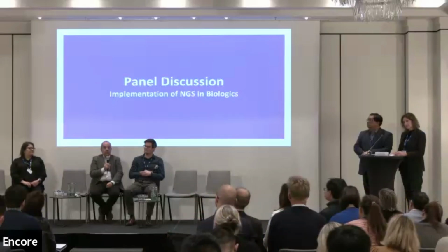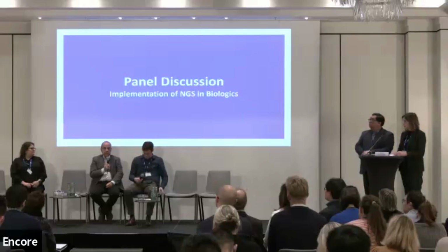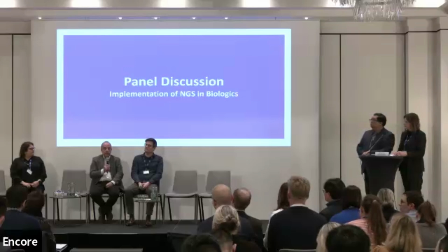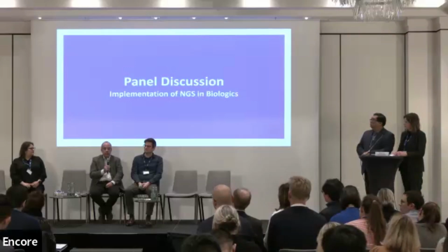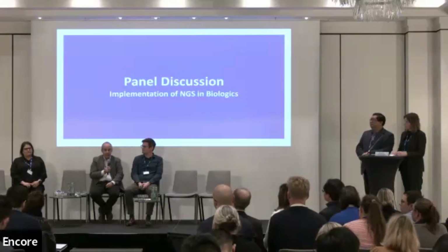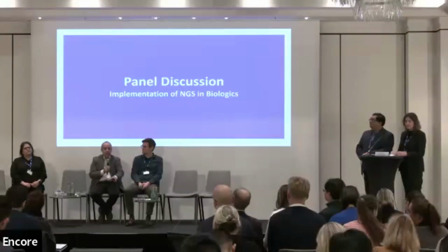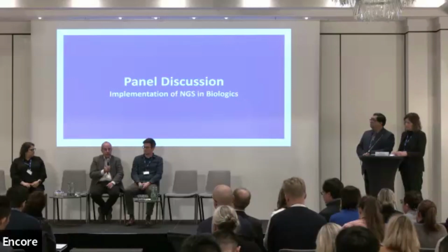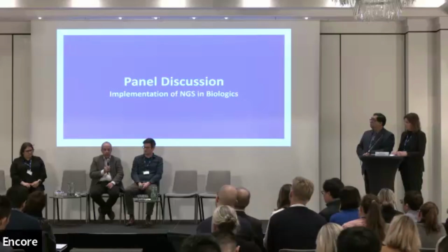Yeah, so I mentioned the 7 months on a cluster to 2 days on a single node for the reference genome collection. This is quite significant because we also had just one cluster when we couldn't run sample analysis while reference genome update was going. So it was inconvenient. And so now it's also offline and it's a simple switch to the new version. So that was huge. In terms of sample analysis, we went from a month to a week.